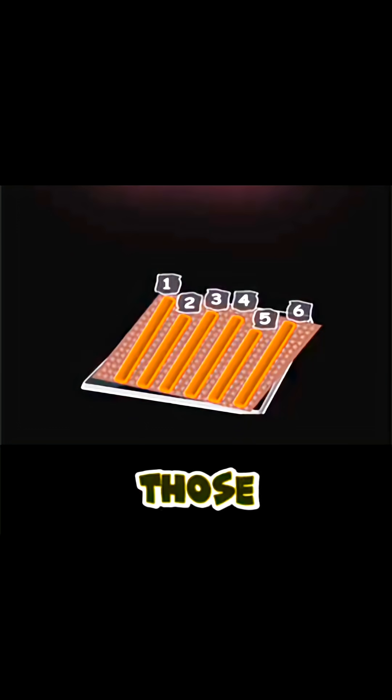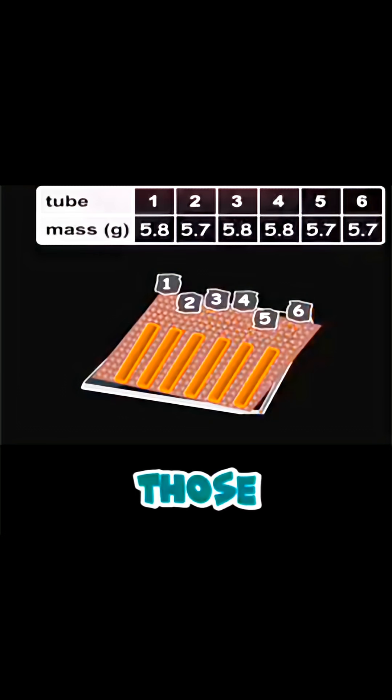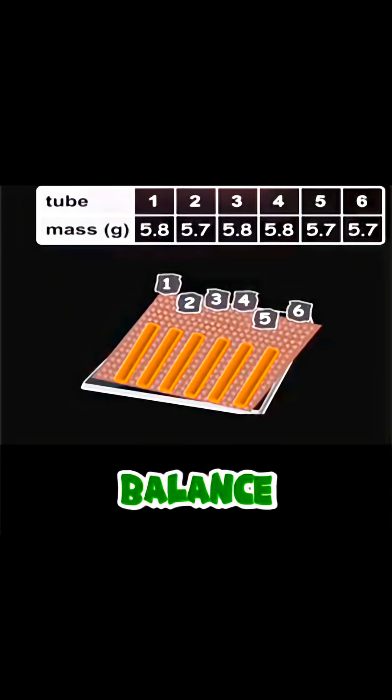We usually use a cork borer like the one you see here to form cylinders. We then cut those cylinders into the same length using a ruler so that it would be a fair comparison between those cylinders. We will then measure the mass of those cylinders using a balance.